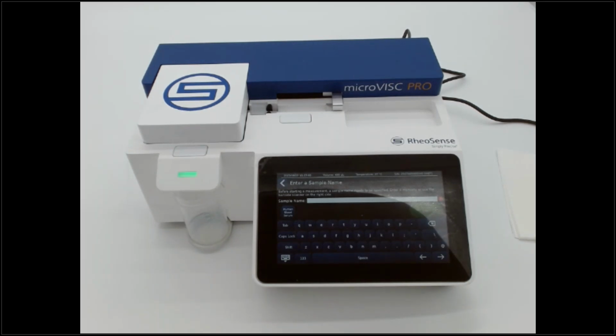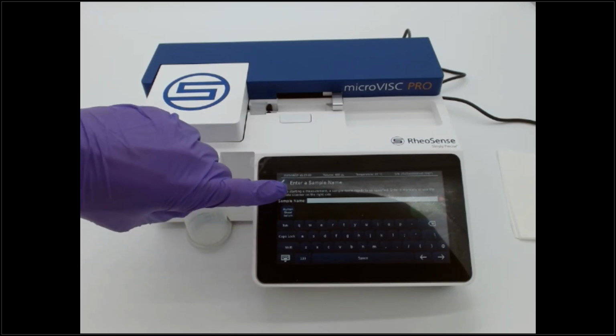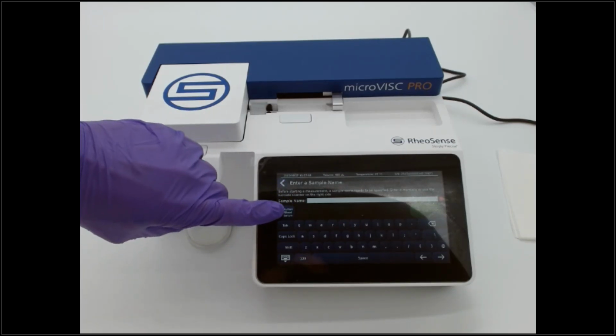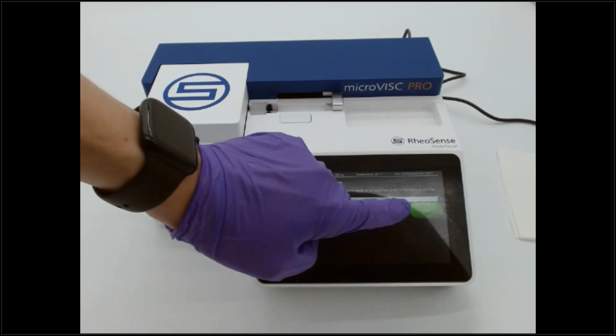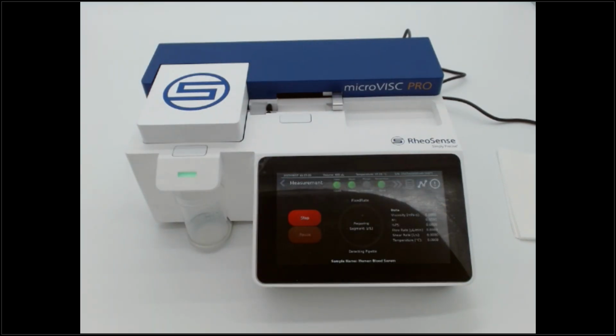Oh, okay. Because the UI cannot see. Okay, thank you. So now we go ahead and enter the sample name. So we already have the previous sample name entered here. So I'll select that and then press start again. So now the unit will start taking the measurements.